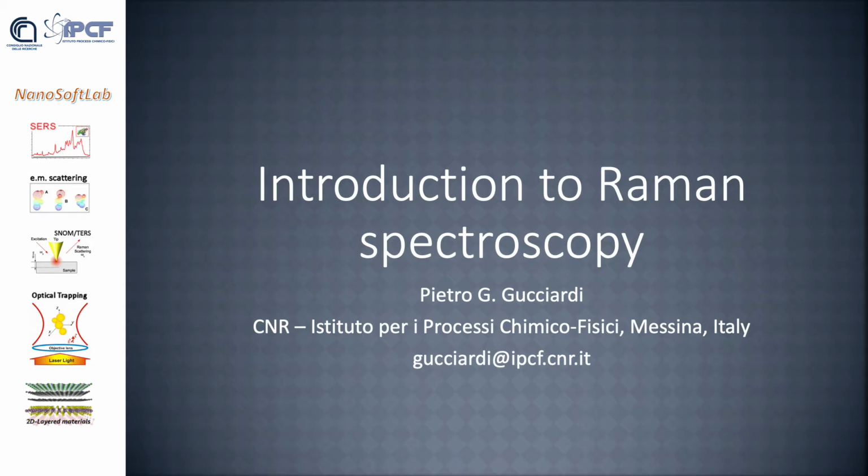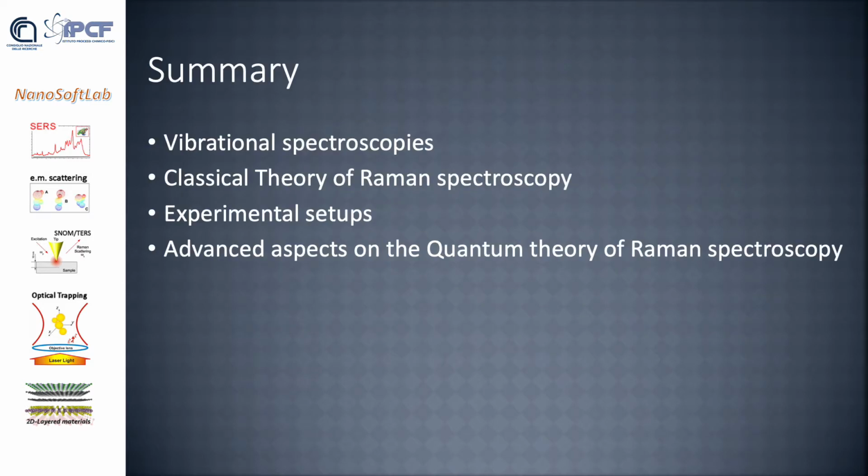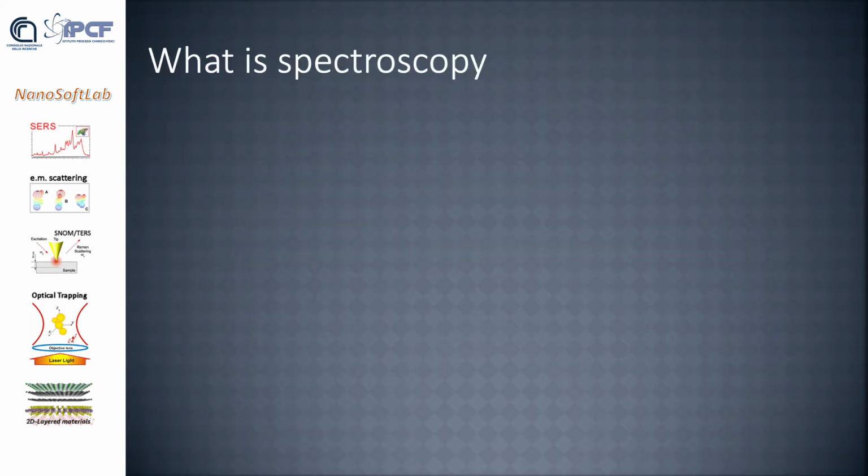I'm Pietro Gucciardi from the National Council for Research, Institute of Chemical Physical Processes in Messina, Italy, and welcome to this first lecture on the introduction to Raman spectroscopy. The first part will concern vibrational spectroscopies, namely infrared and Raman spectroscopy, and then we will discuss the classical theory of Raman, then we will show some experimental setups, and we'll conclude with advanced aspects on quantum theory of Raman spectroscopy. So, what is spectroscopy?